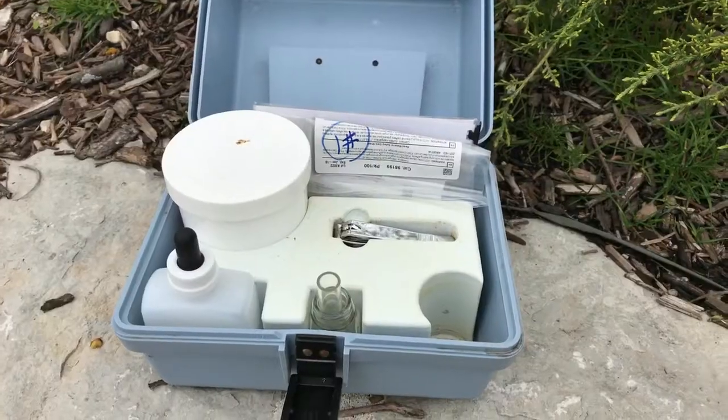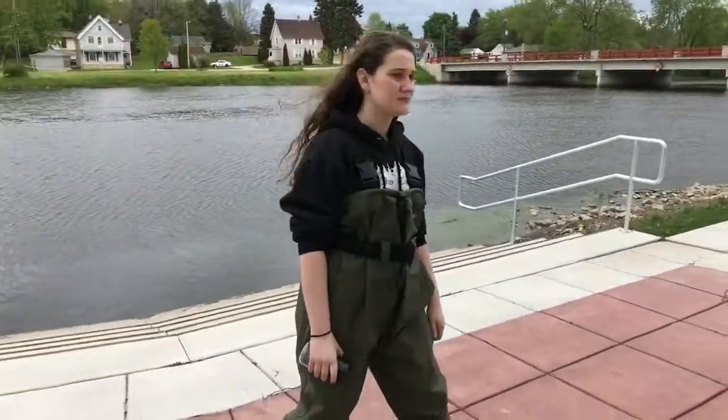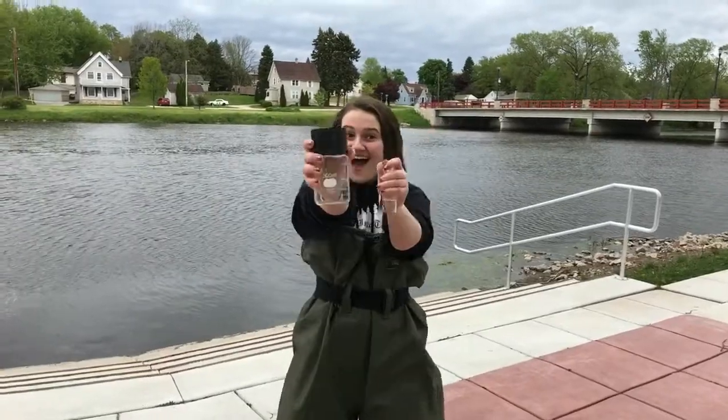During this test we'll measure how much oxygen microorganisms take up. First you'll need a dissolved oxygen kit, a nifty pair of waders, a fleeker, and a flask.